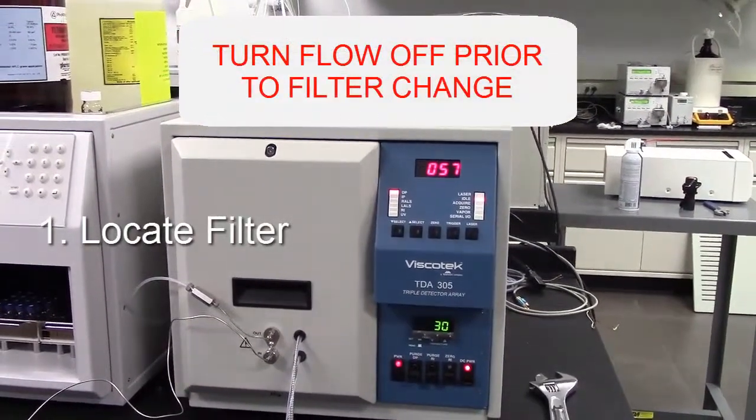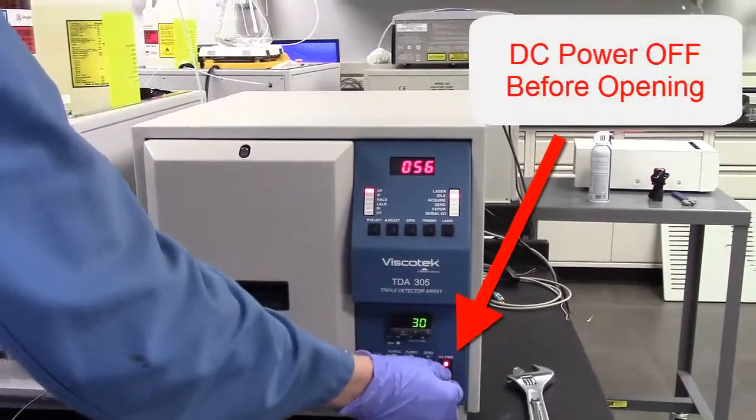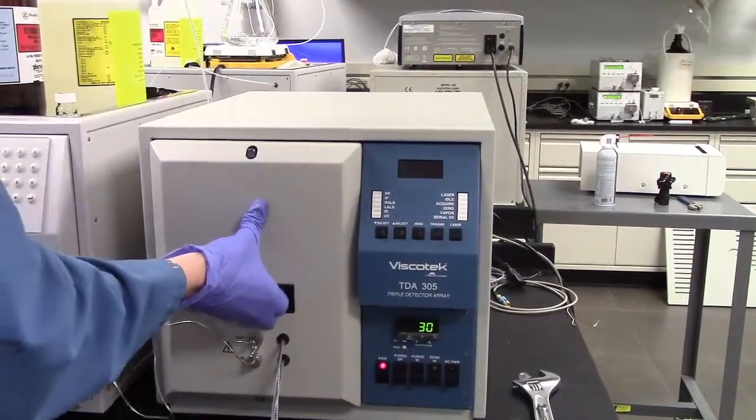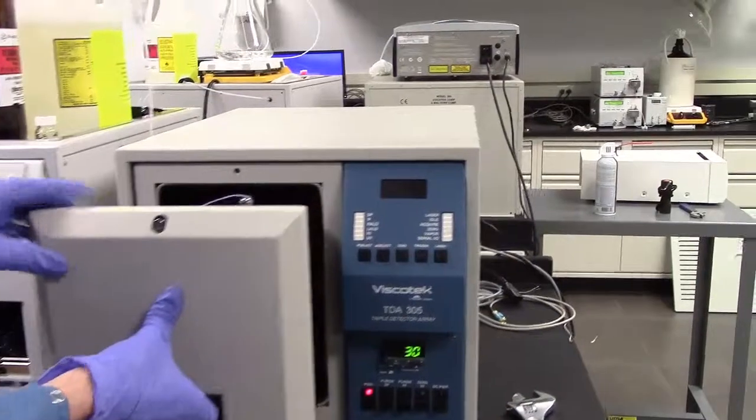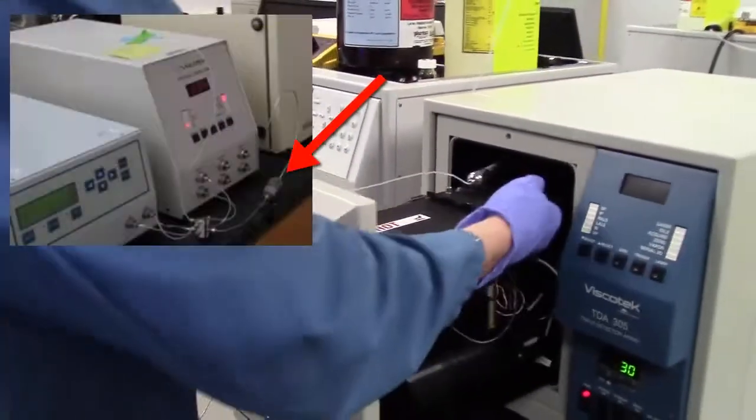When experiencing pressure, noise, or drifting issues, the best place to start is to replace the post-column filter. Remember to turn the flow off before you start and to turn the DC power on the TDA off before opening the unit.